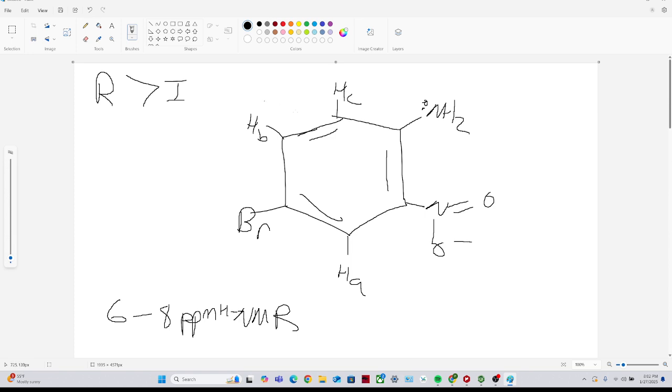So without further ado, let's begin. I like to start off with aniline. If you remember anything from Chem 41b, aniline is an electron donating group by resonance, but inductively it's electron withdrawing. Since resonance, as I mentioned, is stronger, the aniline's pi donation is going to be the more significant contributor to chemical shifts.